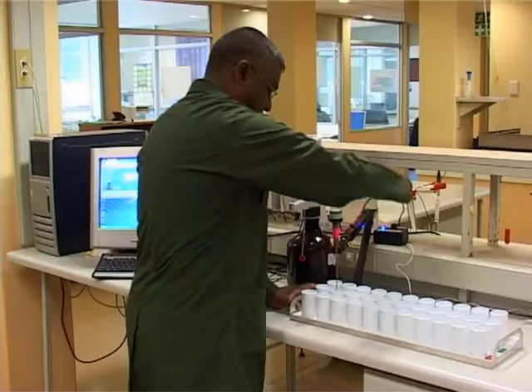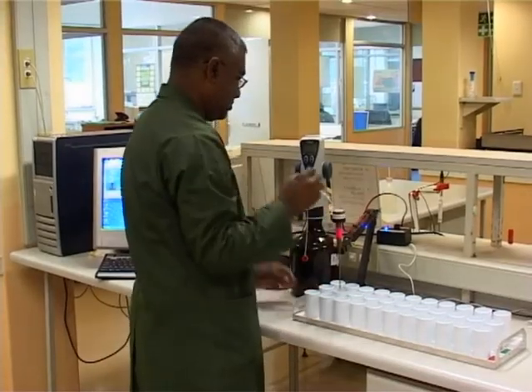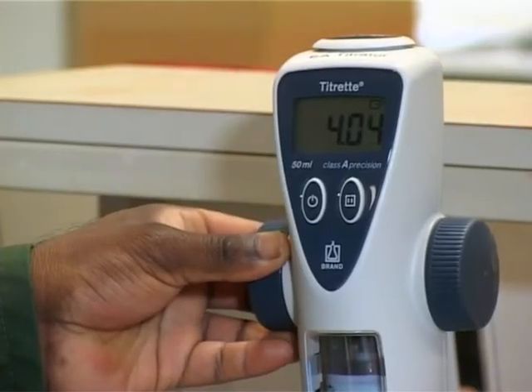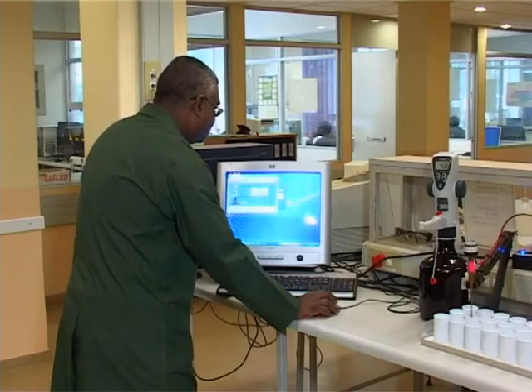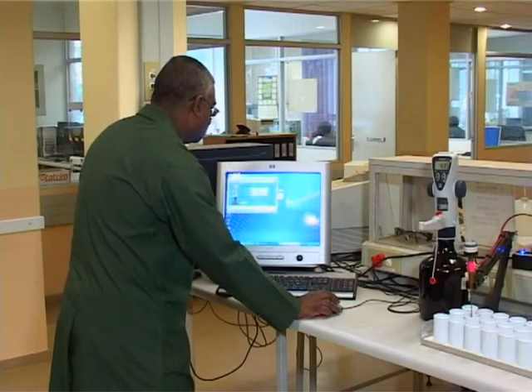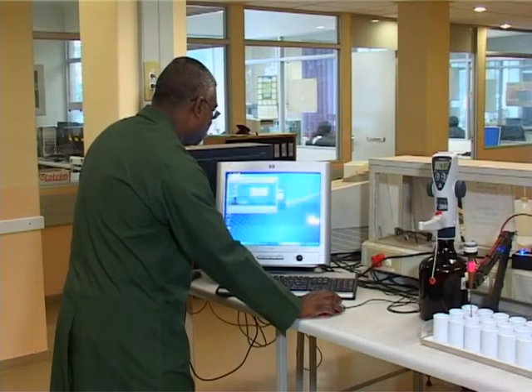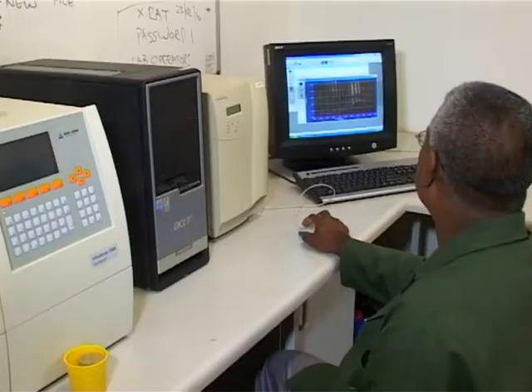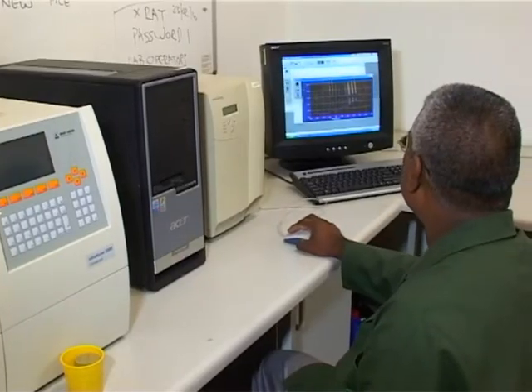As part of the changes to the laboratory, we've introduced new methods which improve the accuracy and speed up the analysis. Wherever possible, we use computers to automate the process. This improves the sample flow through the laboratory and reduces errors.